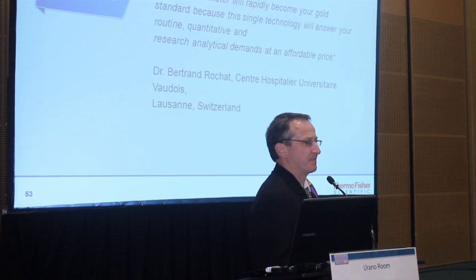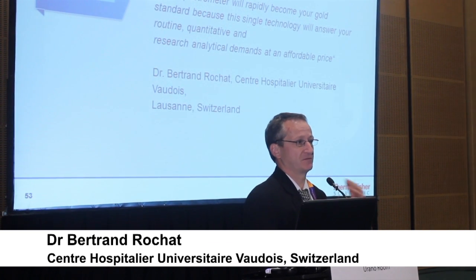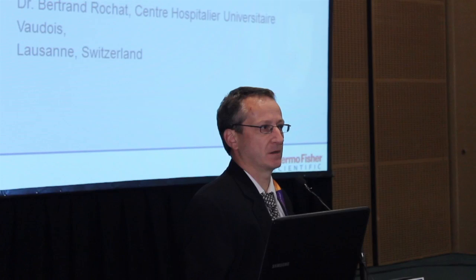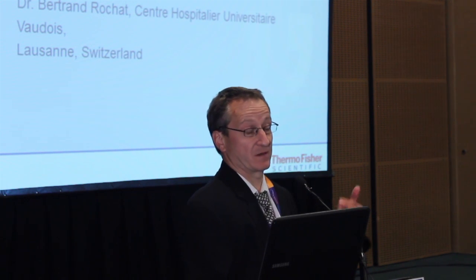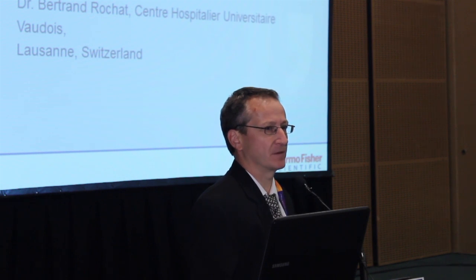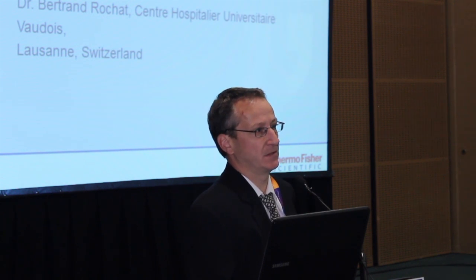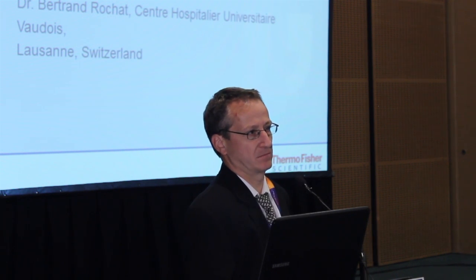Yeah, hello everybody again. I have this instrument only for a couple of months, and I didn't have time to produce data yet to present here today. But I still work with Q Exactive and Exactive Plus instruments. And as I said this morning, I invite you to consider this kind of technology, high resolution, for your routine analysis. I'm pushing that for the last few years already. I think with this instrument, this is a kind of silent revolution on one point: the price. I don't know exactly the price, but I think what they told me, this is the same price as a triple quad, right?